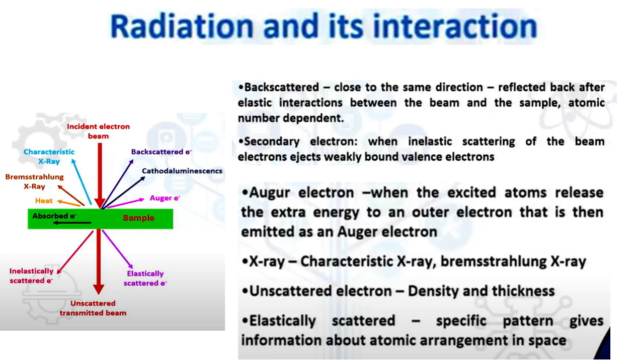Now XRD, before going to XRD, first we'll discuss what are the different phenomena that happen when an incident electron beam is irradiated on a sample surface.